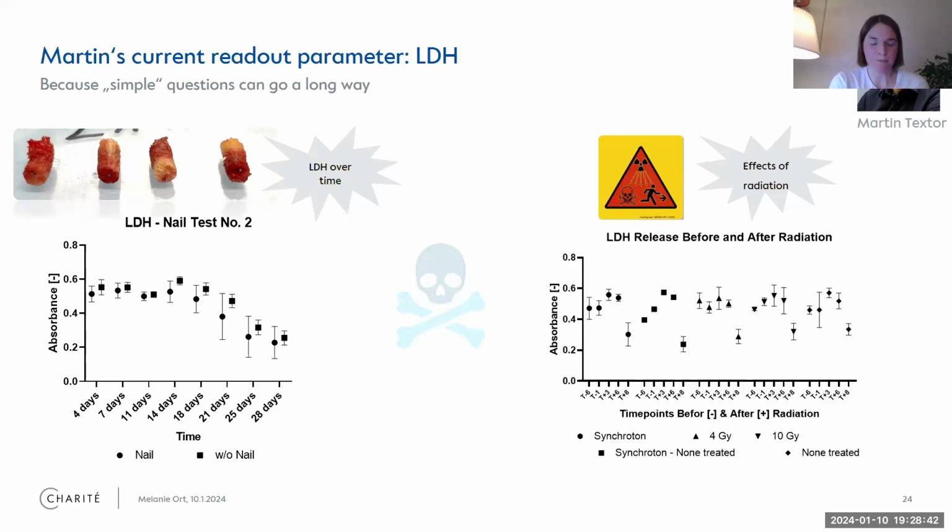Another thing was just to show that we are thinking in different directions and what's possible. I told you that we use a lot of the synchrotron radiation, which is X-ray. So we were also curious, how is this transporting the chip? Because actually, if you do CT or if you do the synchrotron, you have to transport the samples as well. And we just wanted to see whether that's affecting the system. And so this is just nice to see that one assay and one good idea can answer a lot of first research questions.